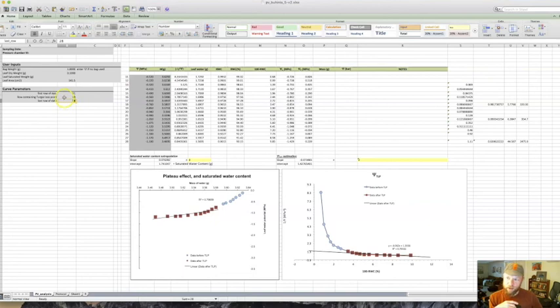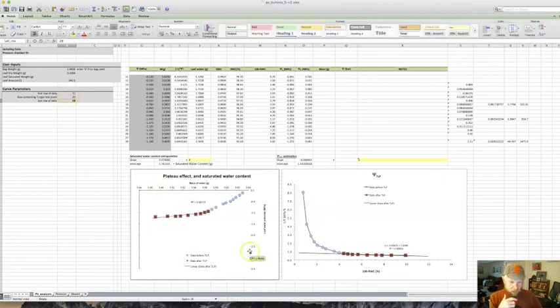All right, so if I try the turgor loss point being on row 18 of the data, you can still see there's a lot of curve in these data points, and so I don't have a total linear line. And so I'm going to go up to 20. That's looking pretty good. Some of these down here, this far left one looks like it's a little above the line. It might be in the curved part.